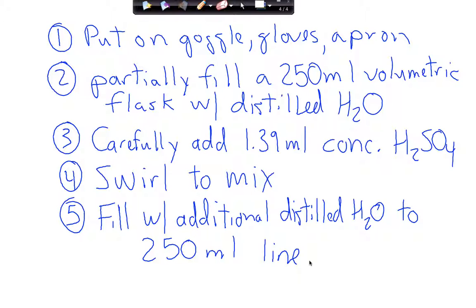Let's talk about why. So guys, the rule is this. You always add acid to water. You never add water to acid. Do you want to jot down just a note on that? Let's do this. Always acid into water. You always add acid to water. Never do it backwards. You're going to get hurt.